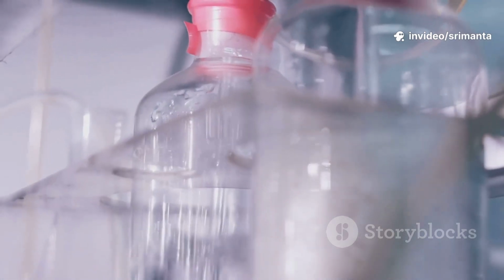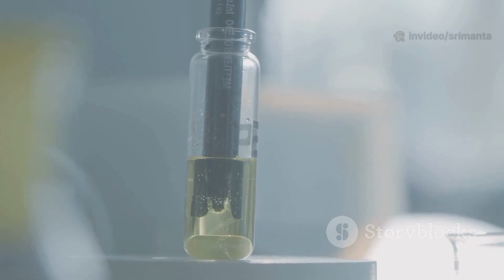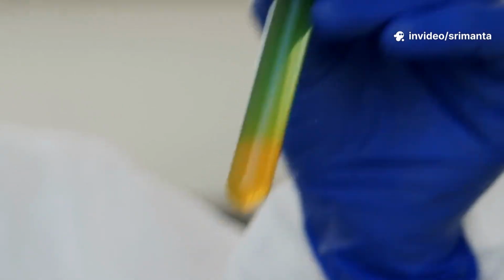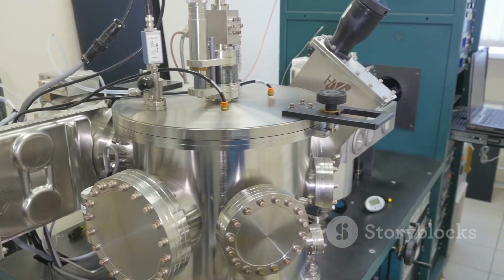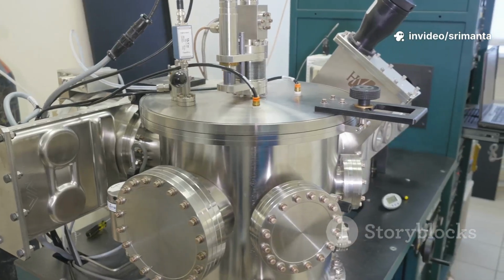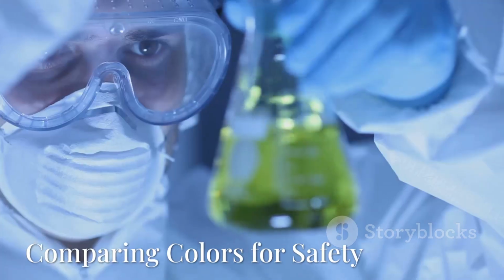So let's review the whole setup. We have the bottle at the bottom where the gas is made. We have the long tube to guide the gas upwards. Inside the tube, we have the lead acetate cotton to purify the gas. And at the very top, we have the mercuric chloride paper to detect the gas and create a colored stain. Every single part of the Gutzeit apparatus is designed with a specific purpose in mind. It is an elegant and effective system for isolating a specific chemical, guiding it, and making it visible to the human eye. It is a fantastic piece of chemical engineering.